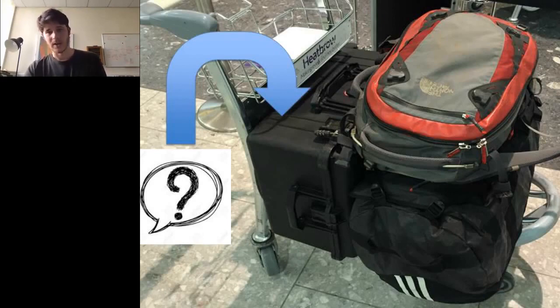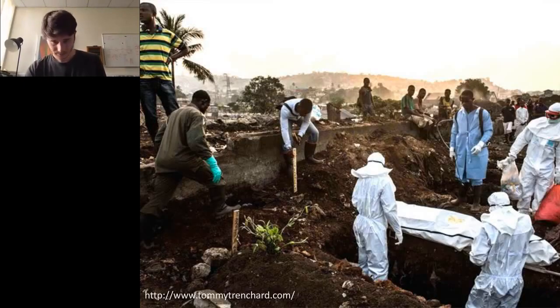So we also had a research question when we were doing this, which was basically, can we set up this lab and can we generate genome data in the field in a useful time frame? And I think that was certainly proved to be very successful, more successful than maybe we even expected.